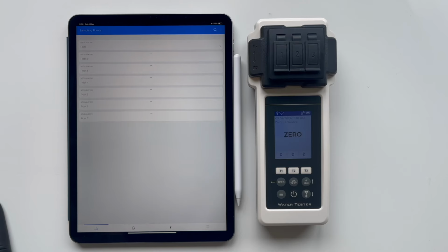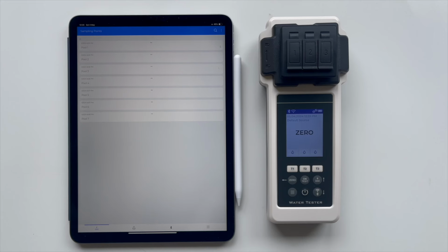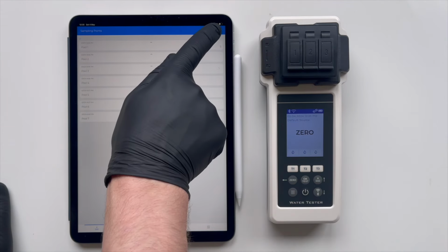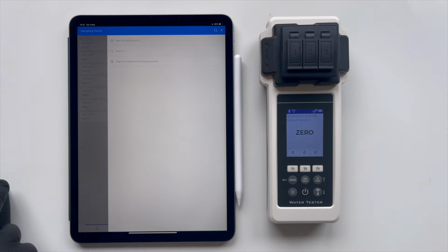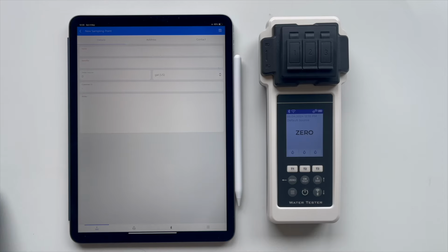And now, we will show you how to create a new sampling point. To create a new sampling point, click on the 3 dots in the upper right corner. A menu will appear, and from there, select New Sampling Point. Enter the name, which for our example, will be Pool.